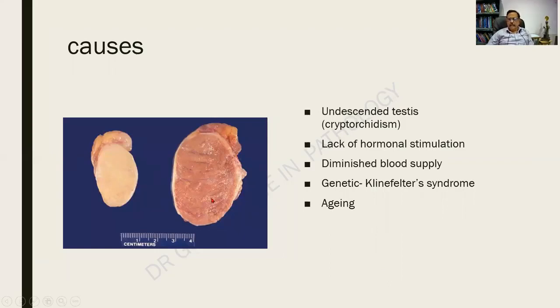And this is another example of it. Compare it with the normal testis. The measurements are over here. You people can measure and compare. So compared to this, it is markedly reduced.